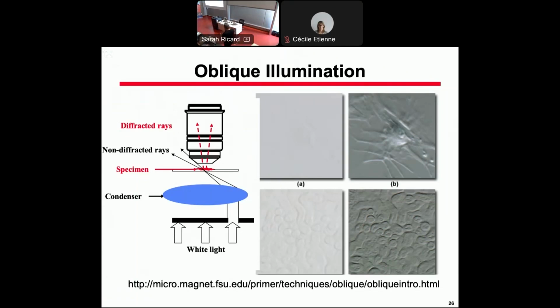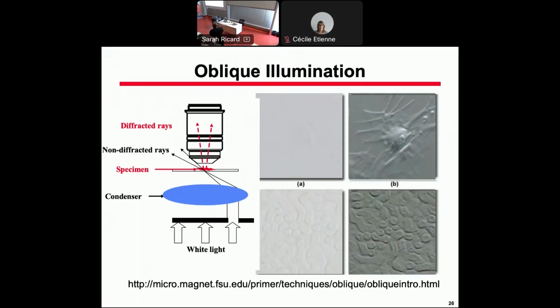So it's a kind of artifact. It works, it's very efficient to detect, but you have to be careful with the interpretation of the image.